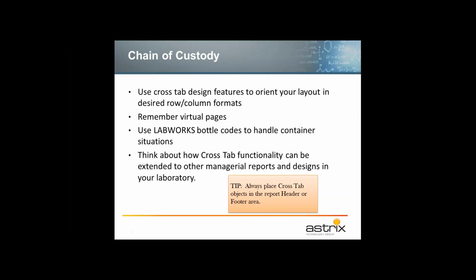And then from a managerial perspective, don't just think about necessarily a crosstab and chain of custody. Think about how crosstab functionality can really be extended to other managerial reports and designs in your laboratory. Maybe crosstabs can help you with other types of managerial summaries as well.